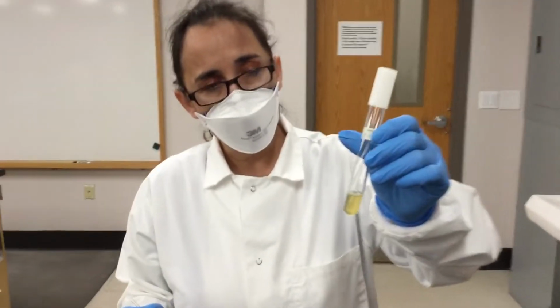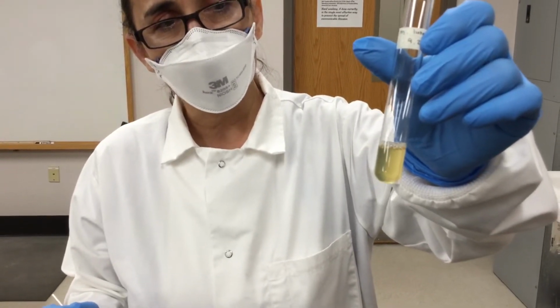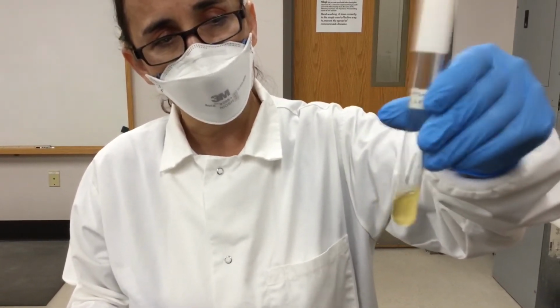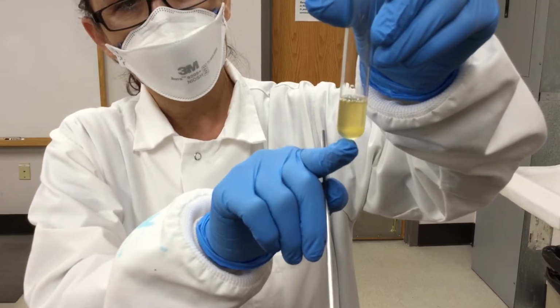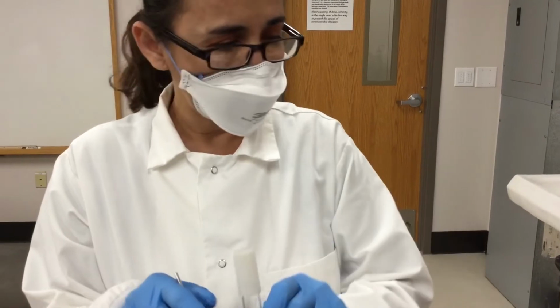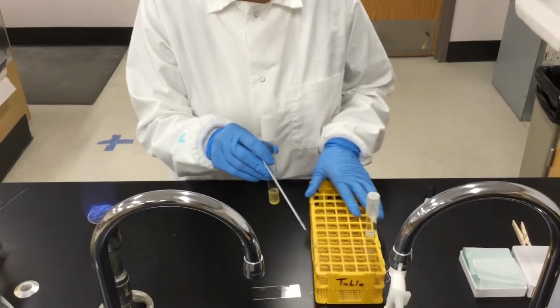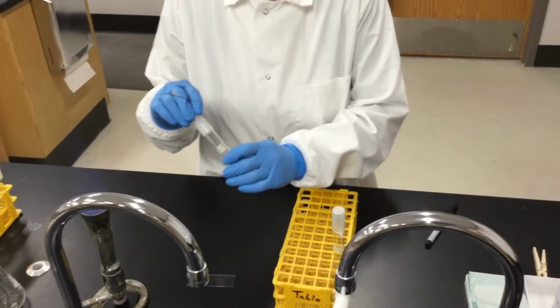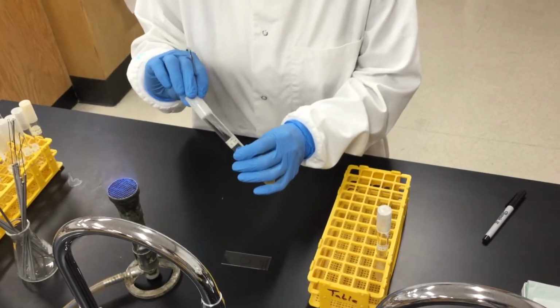And the liquid media, when it's non-sterile, when it has bacteria, looks like this, turbid in color or opaque. And then what you can do to better suspend the bacteria, because by gravity the bacteria tend to go to the bottom of the tube, as you can see there, is shake it a little bit, very carefully to not spill, and then bring your rack close to this sterile area, and then you will open the cap of the tube, withdraw the cap next to the sterile area.